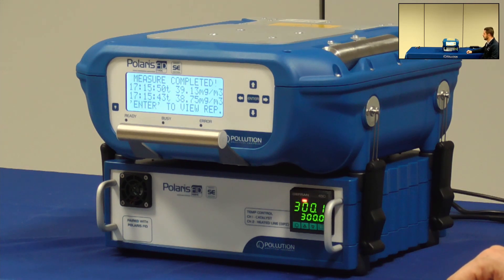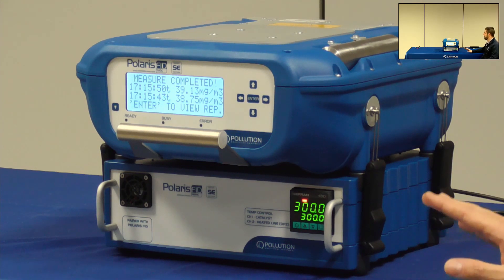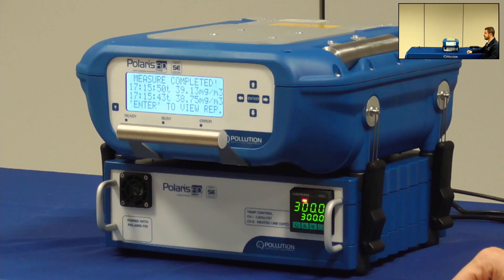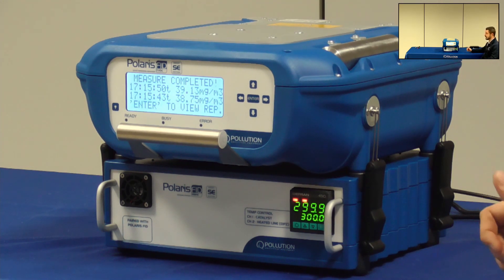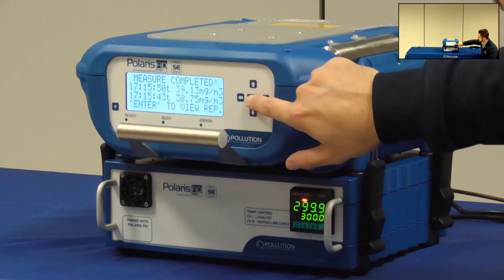So the end user does not need to change this value. The measurement is completed and now I can press Enter and go back to the method menu.